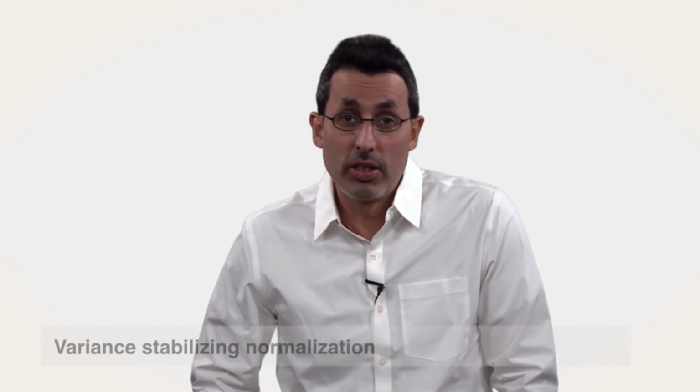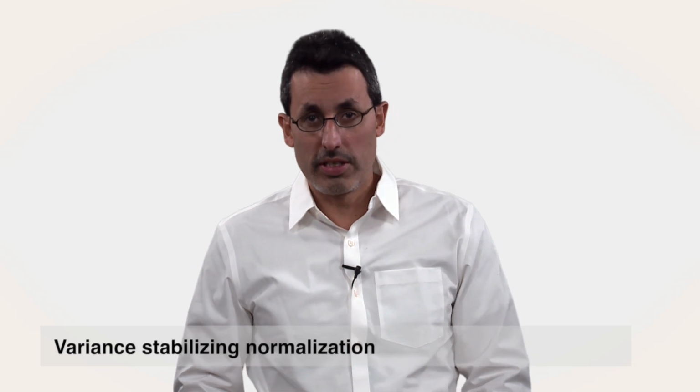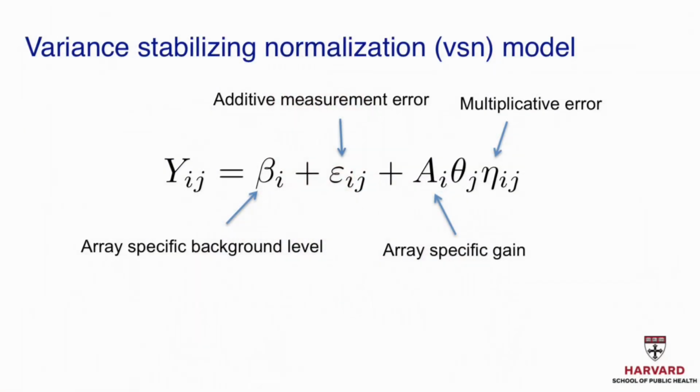In this module, we're going to describe an approach called variance stabilizing normalization, or VSN. VSN is based on the model that we described earlier in the background adjustment modules. The basic idea is to write down a model that describes the behavior of gene expression, or whatever quantity we're measuring, across replicated arrays.